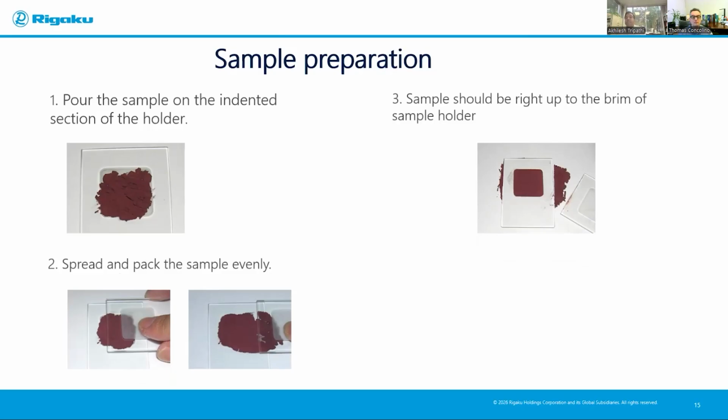This is very essential for getting a good peak position in order to identify all your phases, which eventually will be utilized for the quant work. Clean the sample holder surface. This is a good practice to follow, just to keep your diffractometer clean and not to take any sample which is dropping from the sample holder.